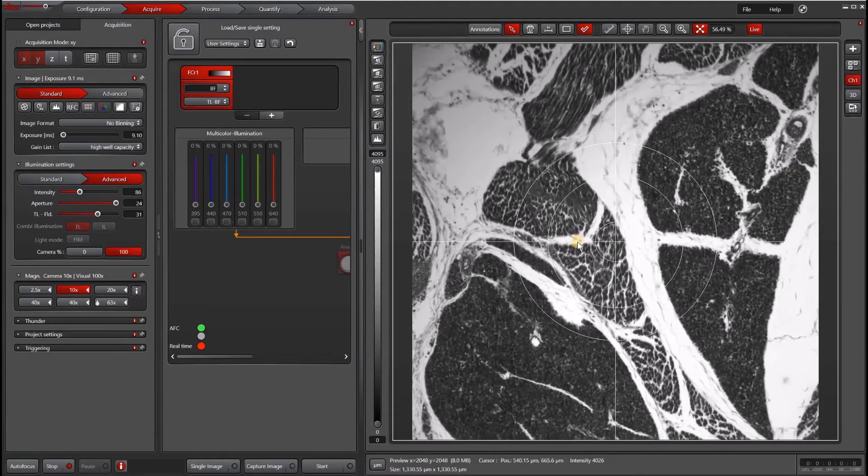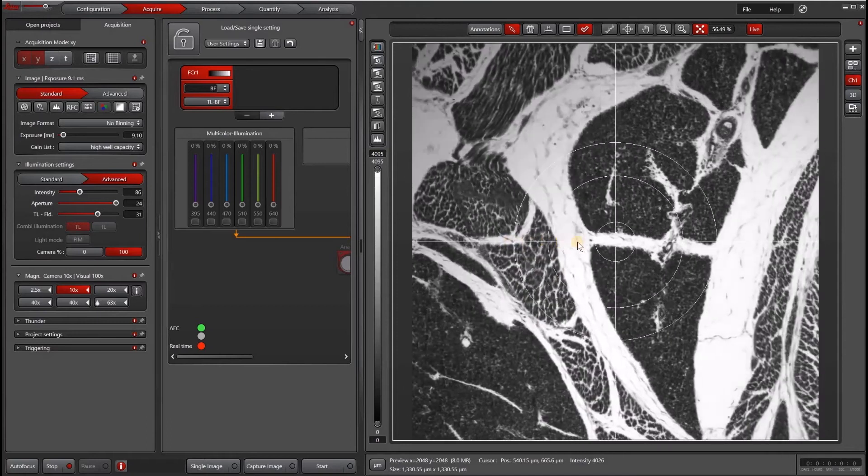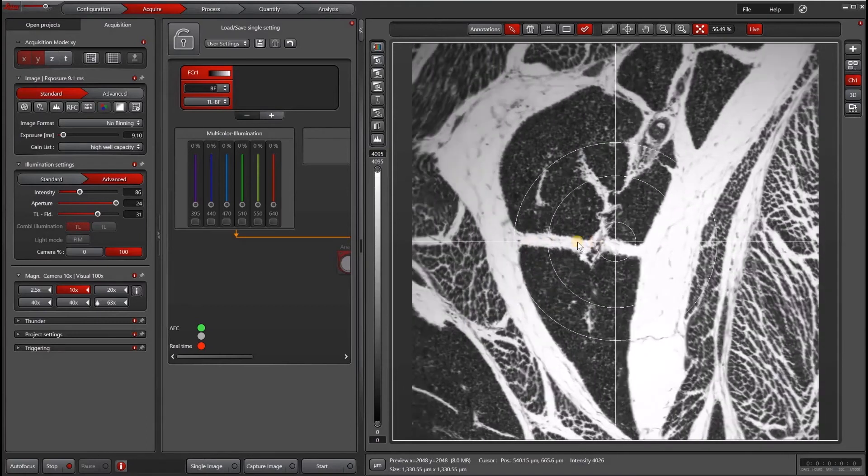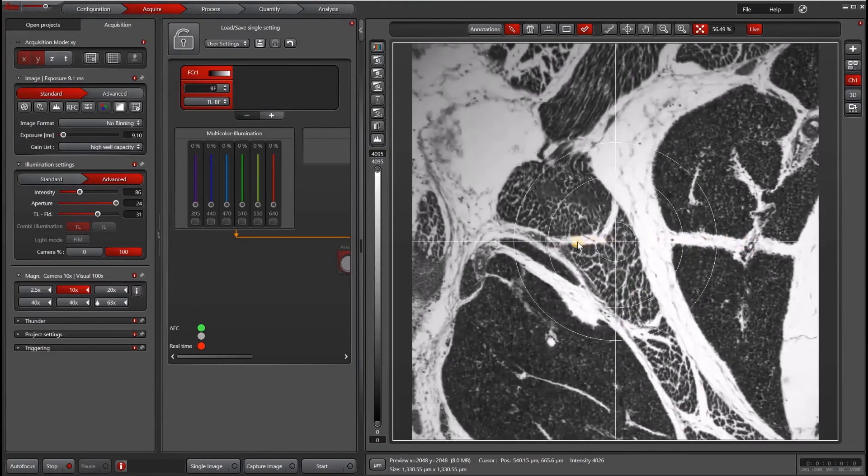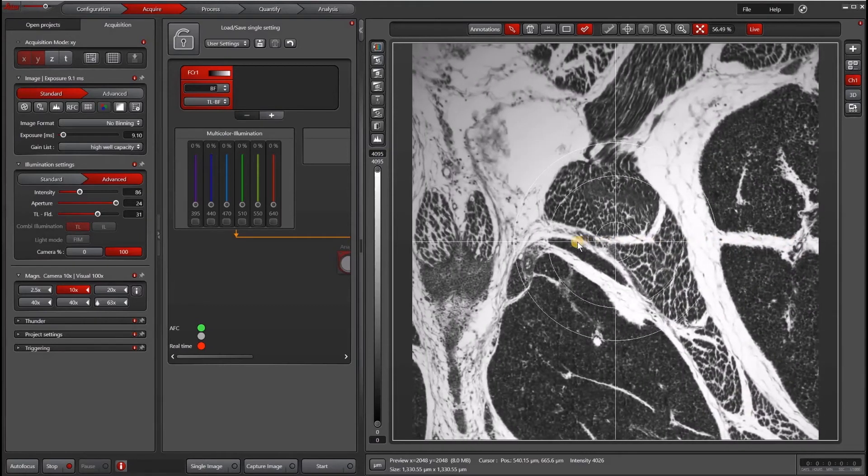And then check again that it's moving more or less along that line. I'm still a little bit off. You can see that this is a little bit tedious, but getting this right is extremely helpful.